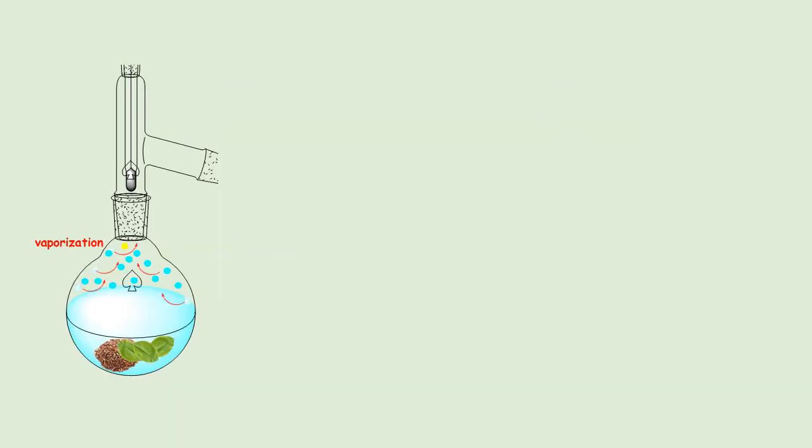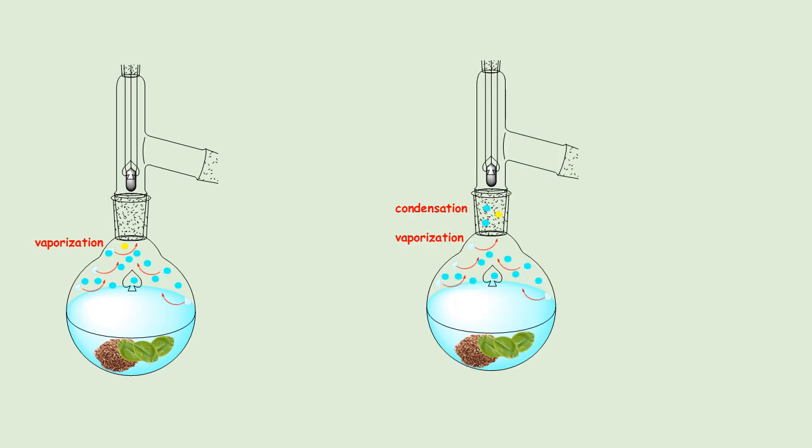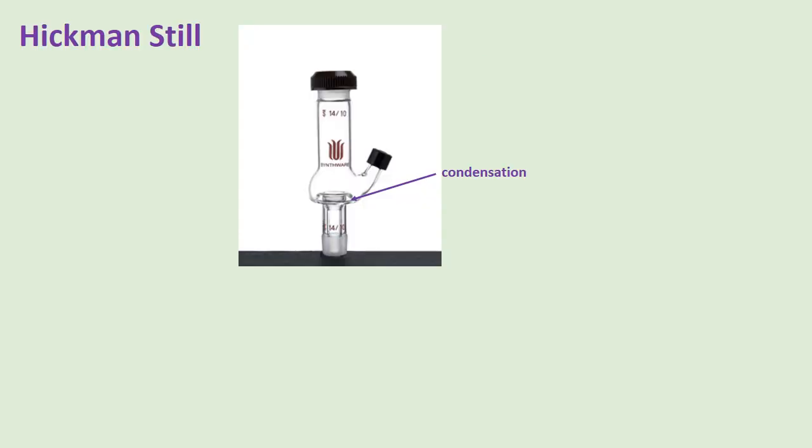Of course, what we want to eventually happen is that the steam is able to push the oil up further and further until you get the mixture distilling over. And if you were to collect this on the other side over here, like you did during your distillation, the nice thing is because these two liquids are not miscible, they would separate out into 2 layers like you have seen a couple of times now during your extraction experiments.